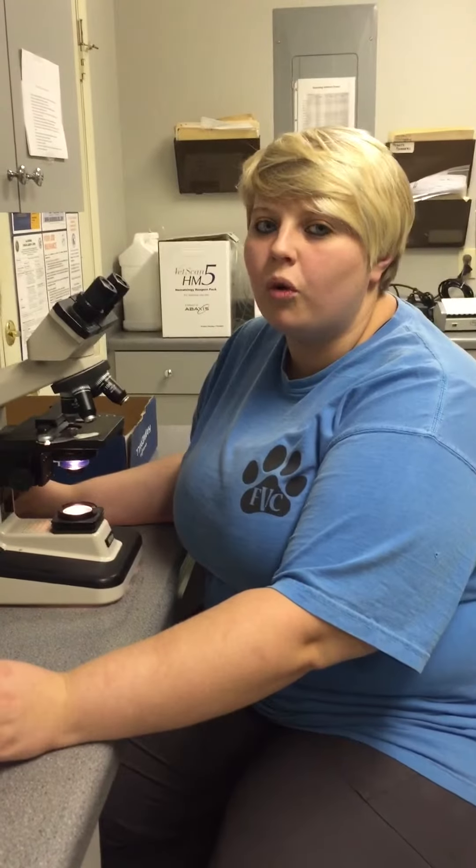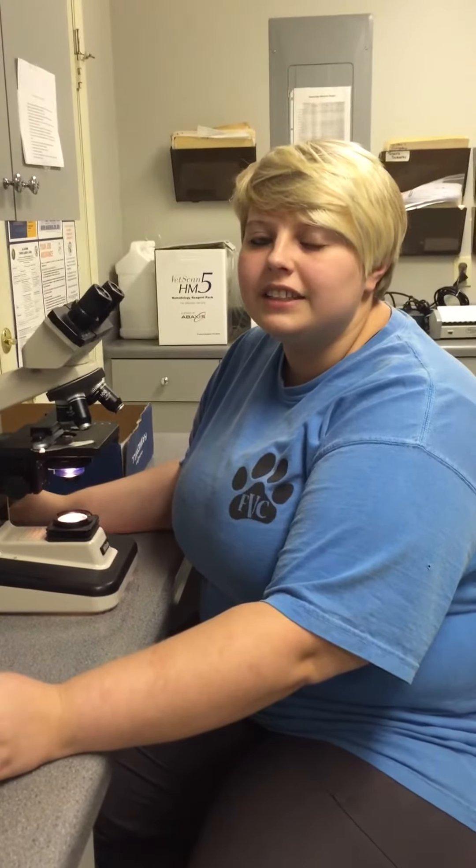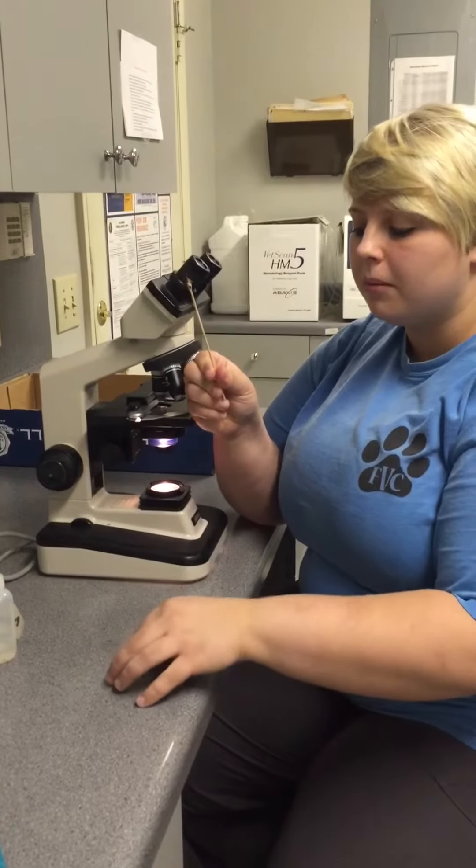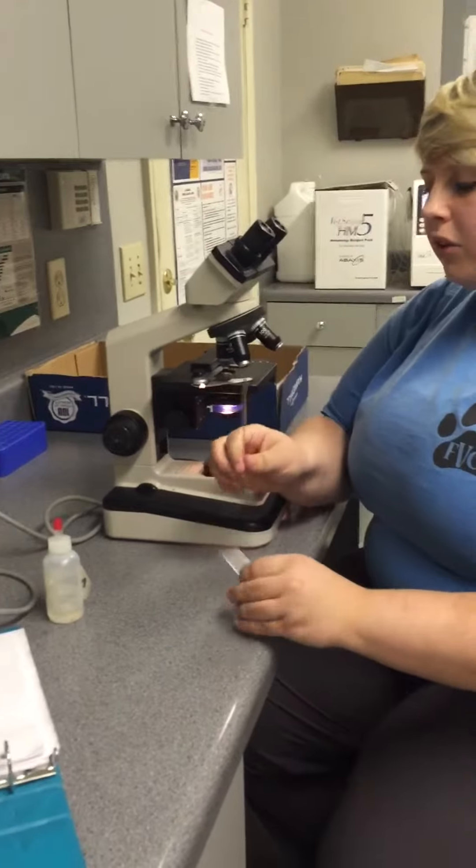I'm Ashley and I'm going to be performing a microscopic exam for ear mites on Bobby Sue. I have my sample, my glass slide, and mineral oil.